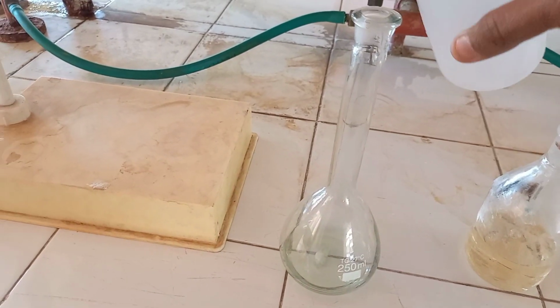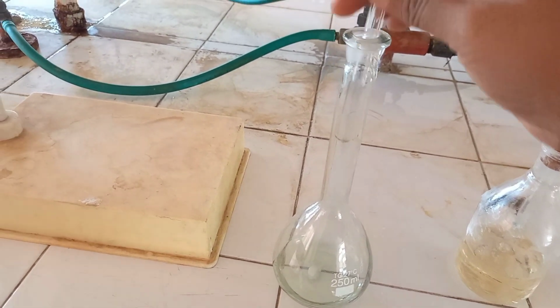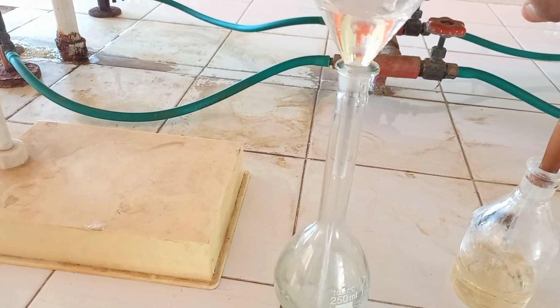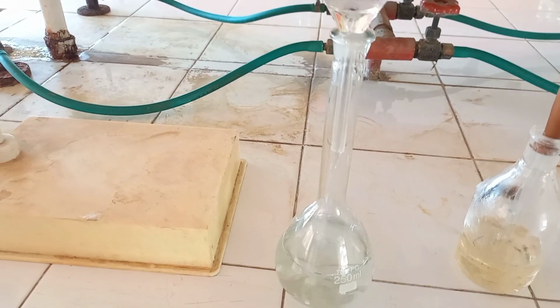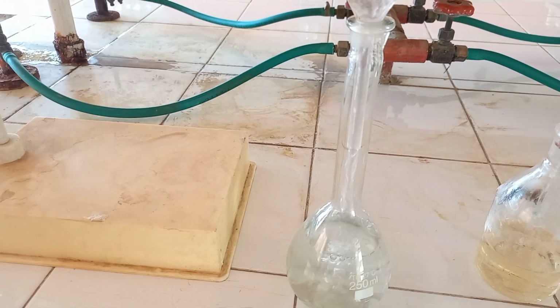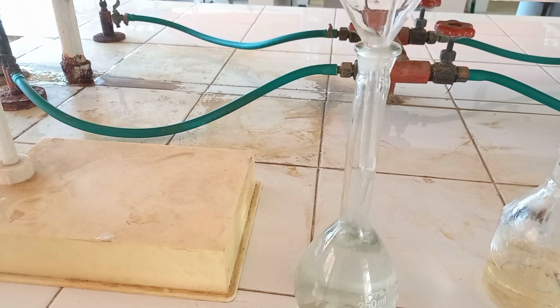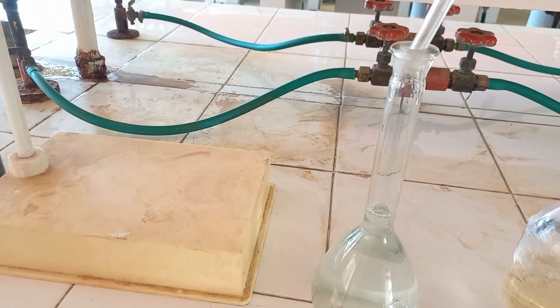So what I am going to do now, I will be pouring water. You can always use a funnel, so it is easy to pour the water and the water will not get spilled, right? We just pour the water till that mark. Be careful while pouring the water. Above that mark it should not reach, and that's why, see, I am slowly pouring the water to get the exact amount up to 250 ml.